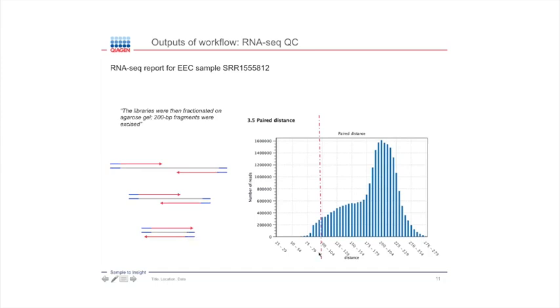So what I've done on this plot is I've marked the line where the length of the reads are, and everything to the left of this line could potentially have some adapter contamination. And typically it's about 3%, I guess, something like that. It depends on the shape of this peak, but I'm not particularly worried about losing 3% of the reads here. So I'm not going to do any adapter trimming. This all seems to have worked out for me.